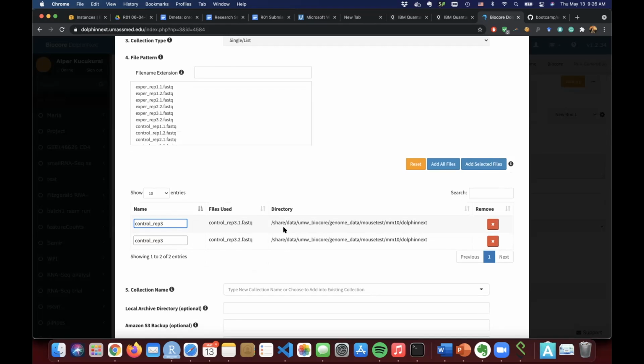So for example, in the browser section, or at the end of today, I think we're going to do a couple of plots. You're going to see how we are using biological replicas. But in some projects, you don't need biological replica information. You just need to pile them up into a single BAM file and then use them like that. It might be possible. That's why we give this flexibility here to merge the files. Or sometimes you do sequencing twice on the same samples. They are called technical replicas. Then if they are technical, you need to merge them and process them as the same sample.